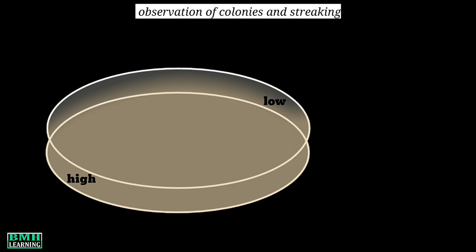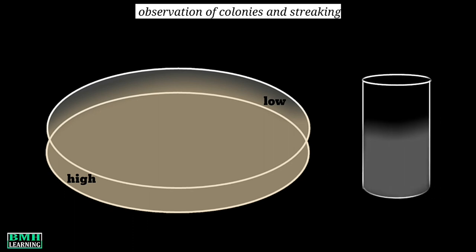The second step is observation of colonies and streaking. This is the E. coli bacterial culture we are going to inoculate. Using a sterile 1 ml pipette, 0.2 ml of the E. coli test culture is added onto the plate. Then, with the help of a bent glass rod dipped in alcohol and flamed, we spread the test culture over the entire agar surface. The plate is then incubated for 24 hours at 37 degrees centigrade.